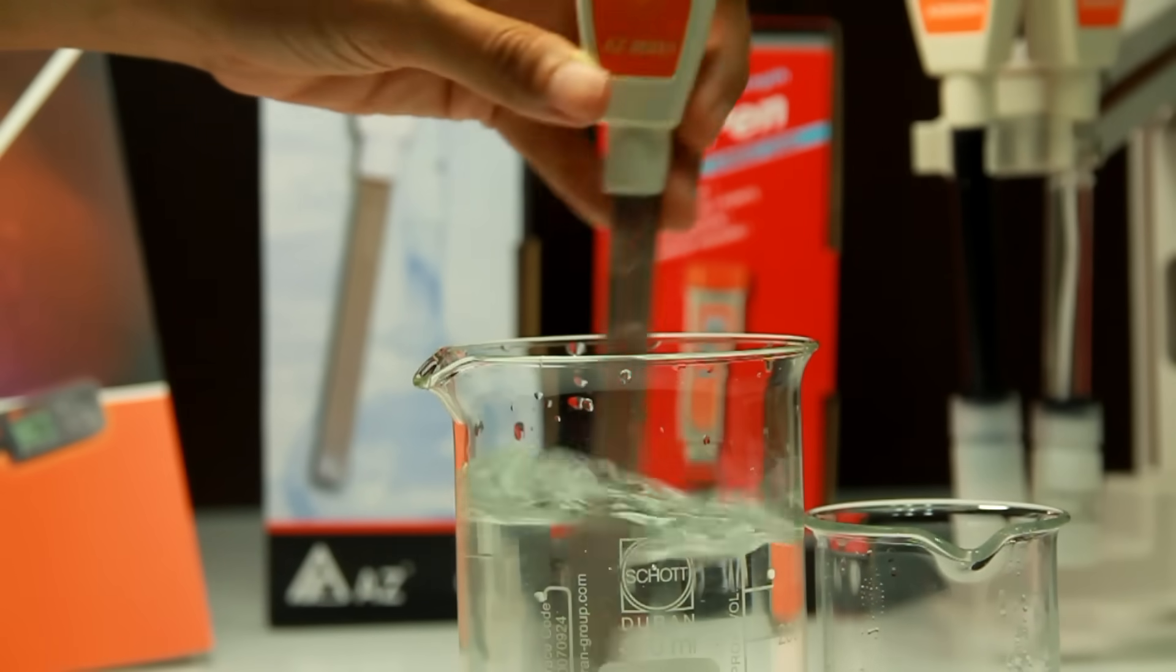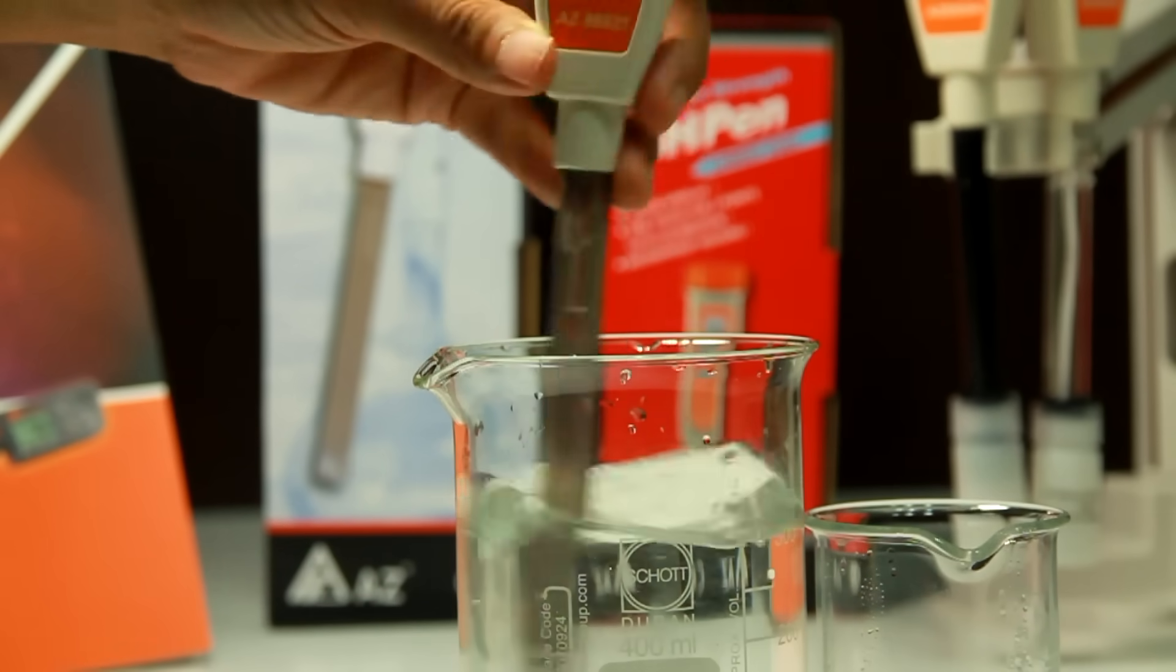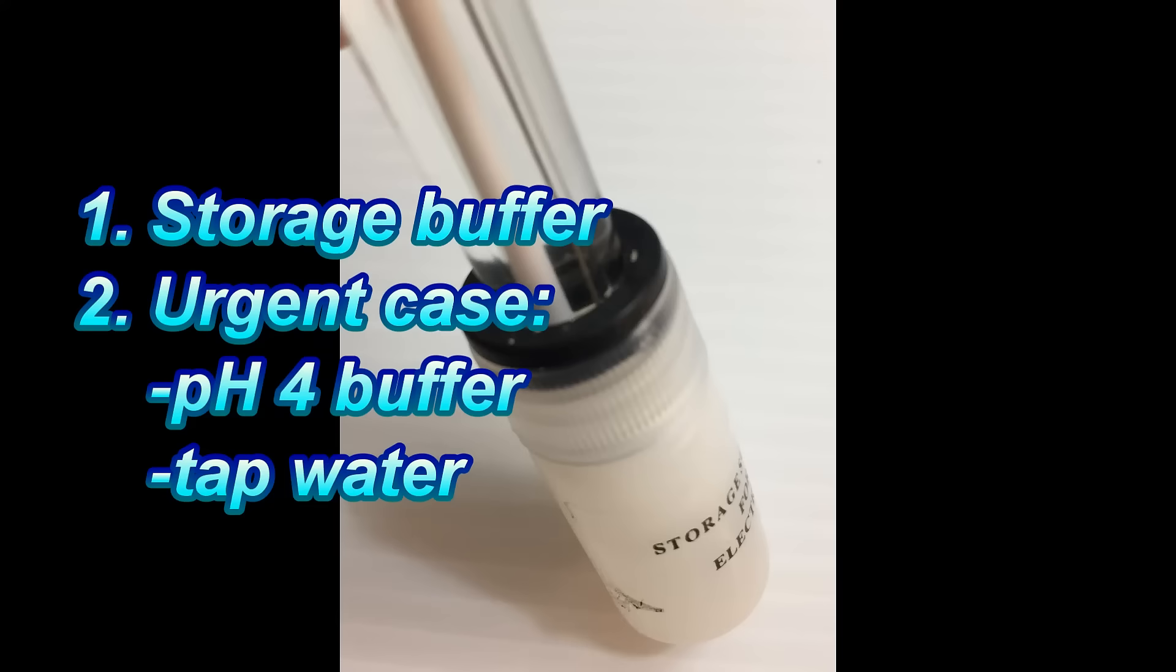After cleaning procedure, always remember to use storage buffer to keep electrode wet. For emergency case that storage buffer could not be acquired immediately, use PH4 buffer or tap water for temporary storage.